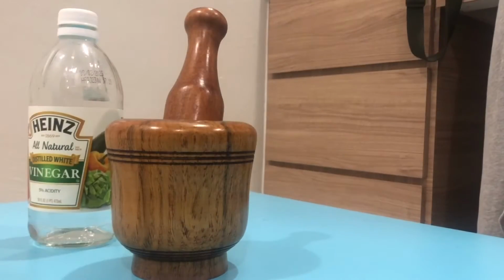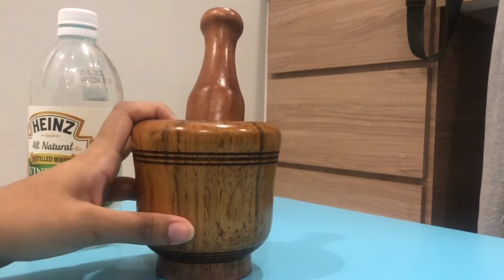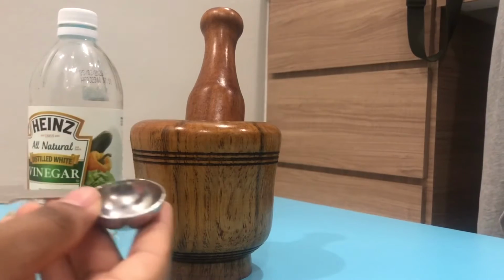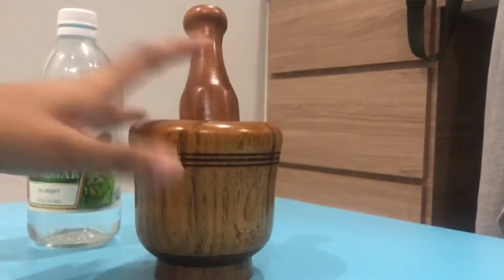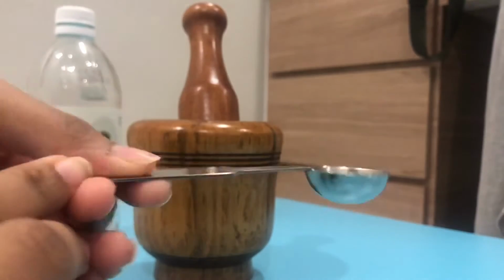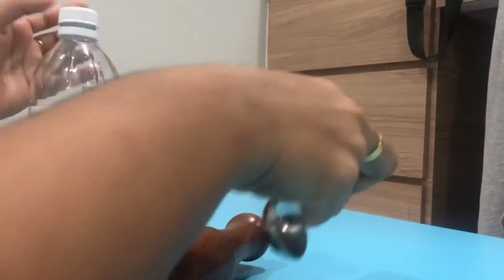So in the first part of the experiment, which is task 1, I'll be showing you how to make the sample. So I'll be adding 10 ml of the vinegar into the fresh sample and crush the leaves. This is actually a 5 ml measuring spoon, so I'll be using 2 spoons of this to make up 10 ml.